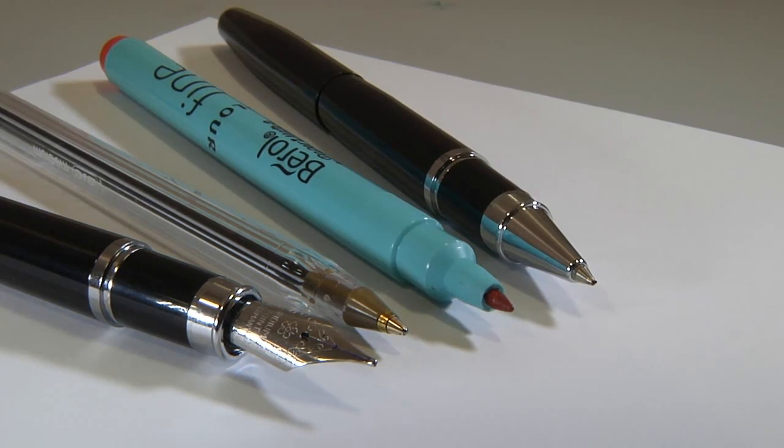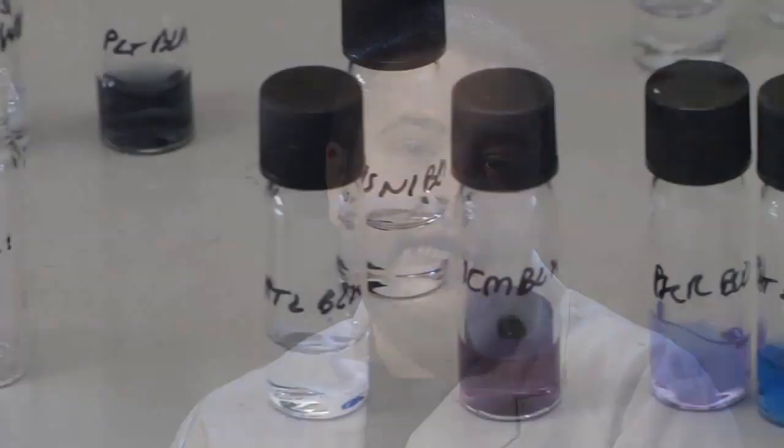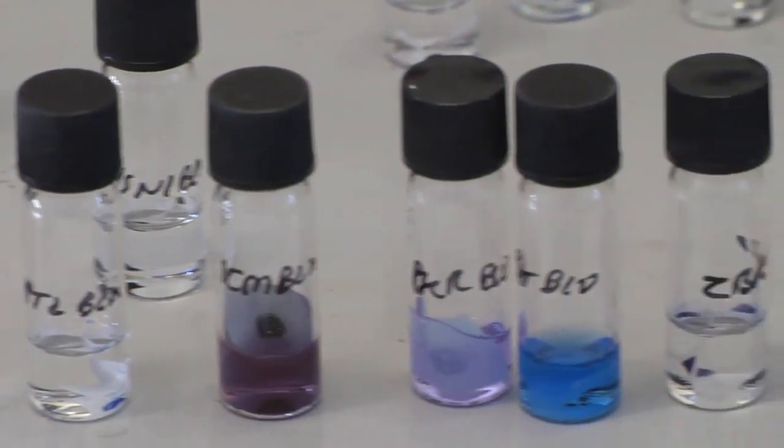That's four different types of pen, but what about the fifth? Well, I will come to that in just a moment, but for now it is important to know that all four of these pens have one thing in common: they all use dyes to give the ink color.